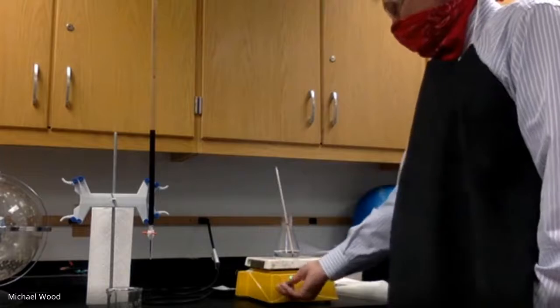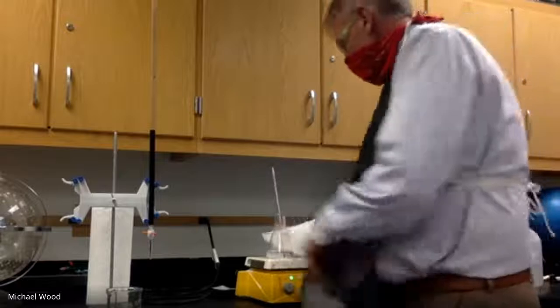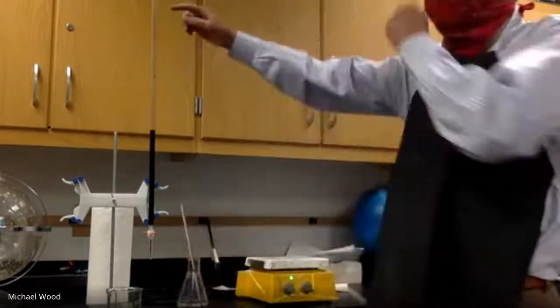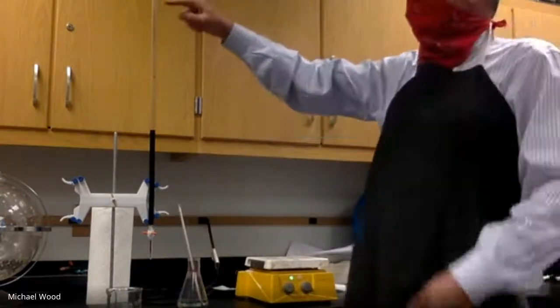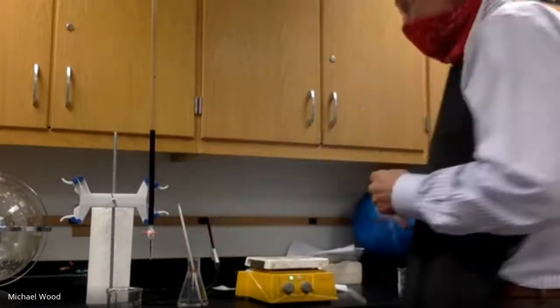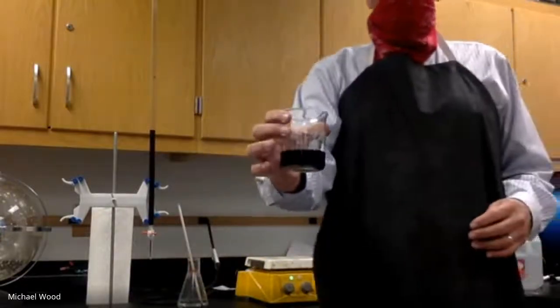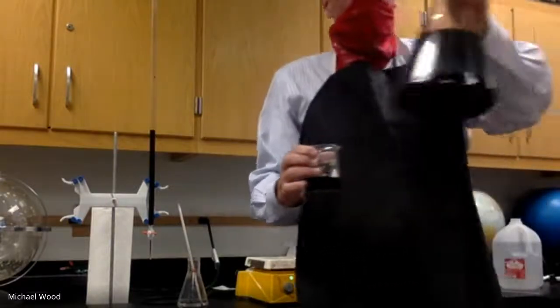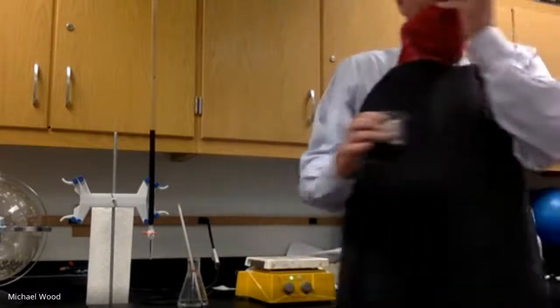Now you would think 50 is up here, and you think 0 is down here. But actually, if I had Kylie or Alan look at this, 0 is up here, and 50 is down here. And the way we're going to measure this, I'm going to pour it here, and this is called potassium permanganate. And I have a big old flask of this that you guys will use. It looks like grape juice, kind of. But I'm going to pour it in the burette.